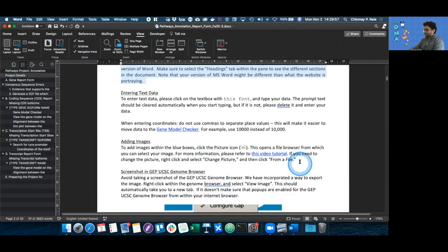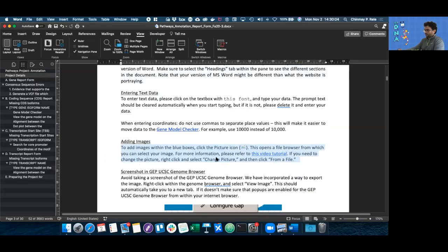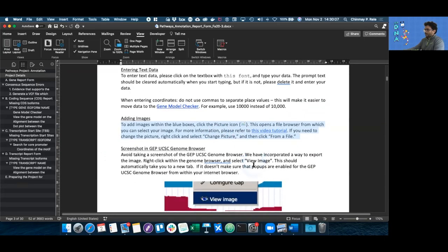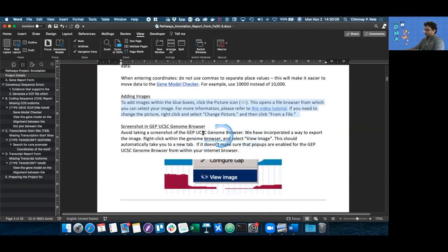This section shows you how to add images in the document, which we'll go into more depth a little bit later. And this section shows you how to download images of multiple things, which again, we'll go into when the time comes.